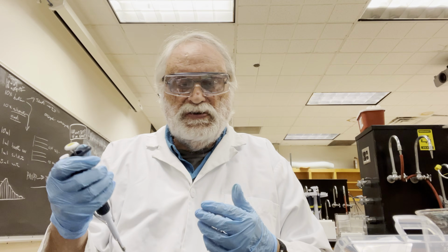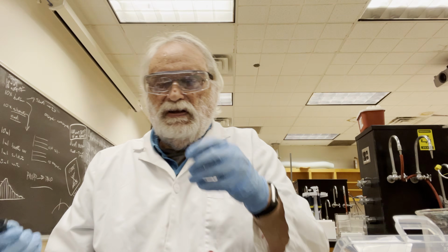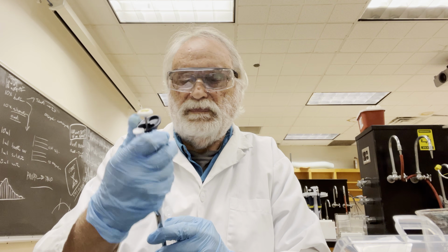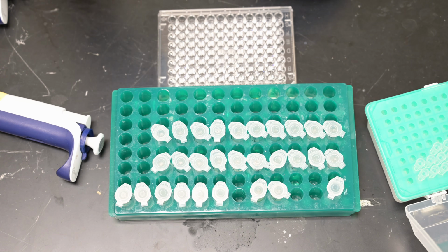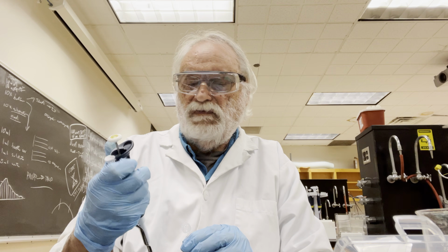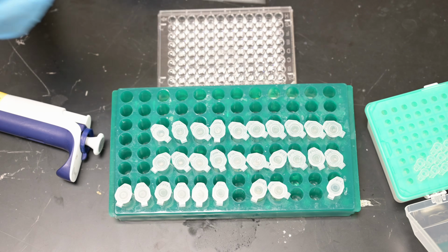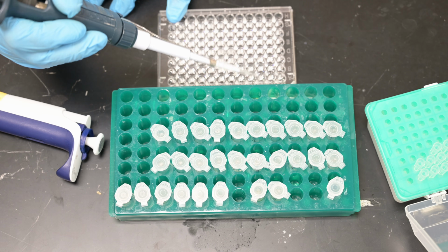Next, we'll add buffer to those samples to make that dilution. We'll use the same buffer that we used the last time. So what I'll do here is go to 10 microliters on the pipette, and we'll add 10 microliters to A2. And then we'll add 15 microliters to A3. So now our lysate has been diluted, so there's neat lysate with no dilution, two-fold diluted, and now four-fold diluted.